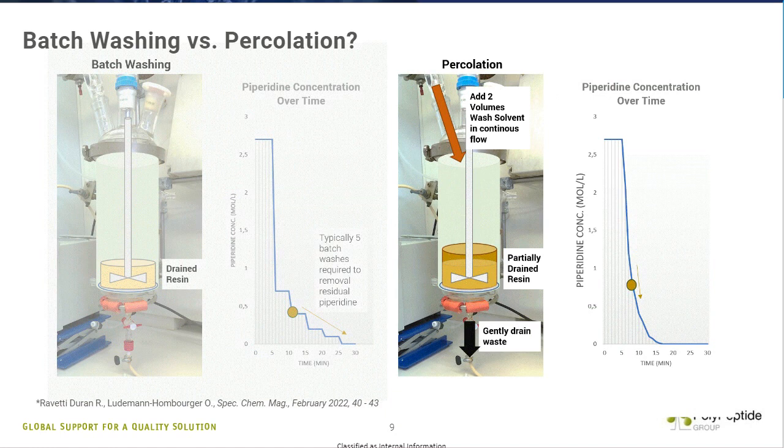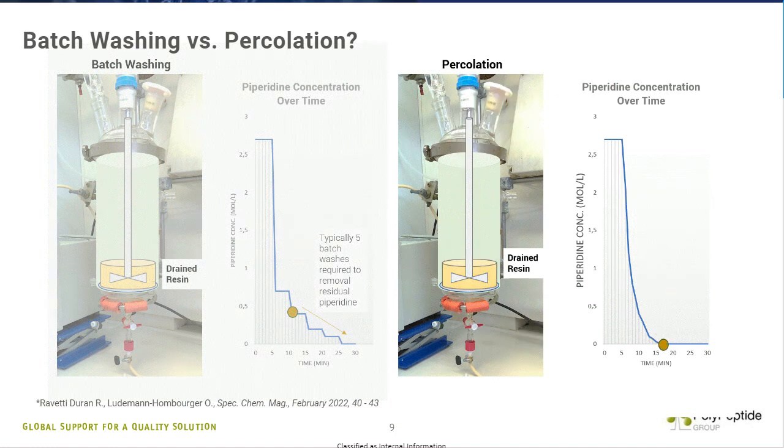In certain synthesis reactors, you have something at the top of your reactor, basically adjusting the bed height.